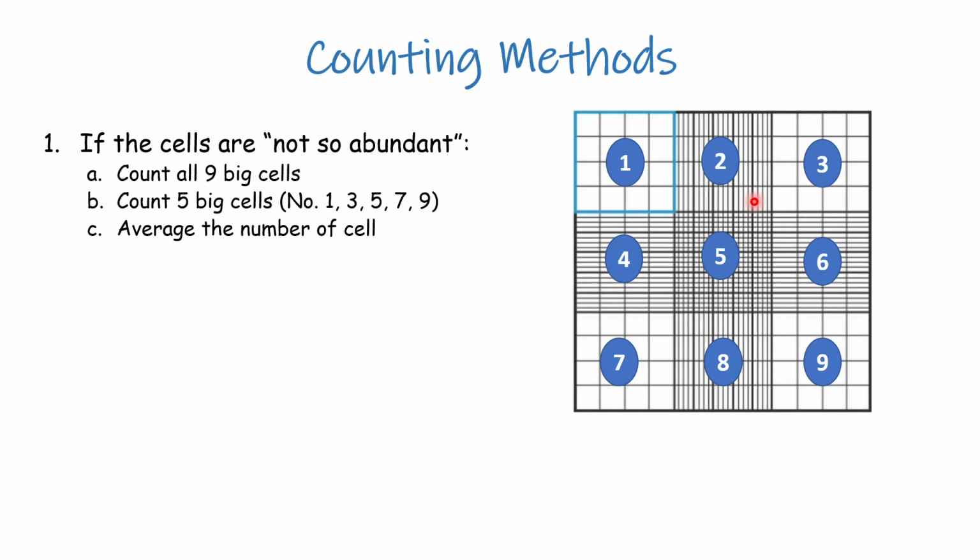when we have samples with the concentration of cells of lower than 10 to the power of 6 or 10 to the power of 7, we can use this strategy. And one way to know if it's that is if you see this small cell over here and you only see about 1 or 2 cells crammed in there, that's still fine. But if you can see 3, or actually let's just say 10, 20, 50 cells crammed in literally one small cell here, okay, you do not want to use this counting method, okay?